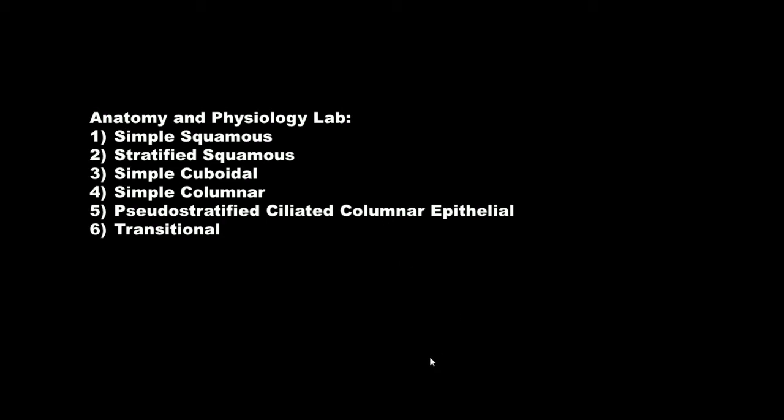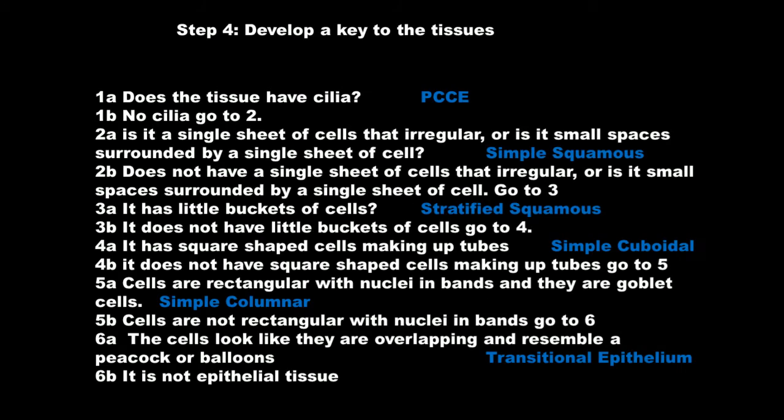The last type is transitional — does it look like the cells are overlapping? Do they look like peacock feathers or balloons? I gave you a key, so if you have this key, write it down or print it up, and you can look at each of these cells. You can even pause at each slide so that you can take time to look at your key and try to key it out.